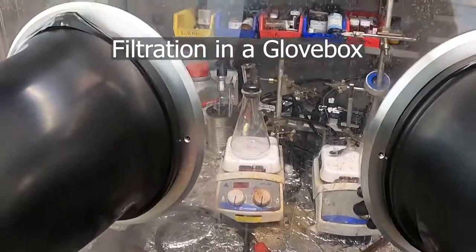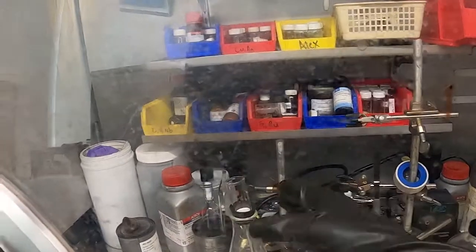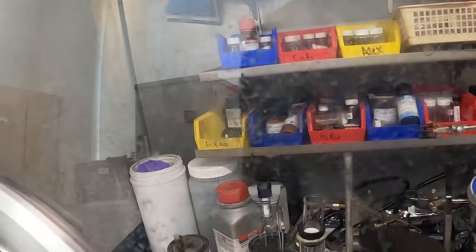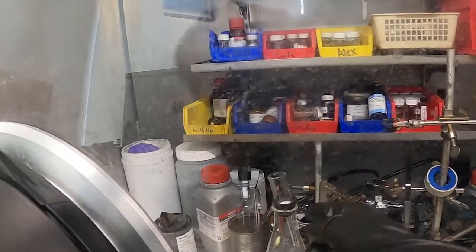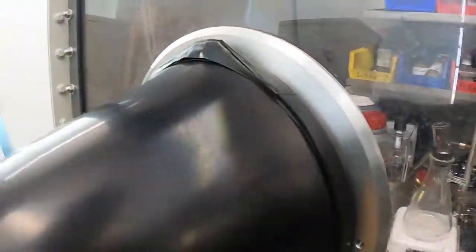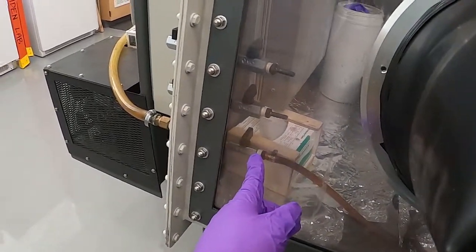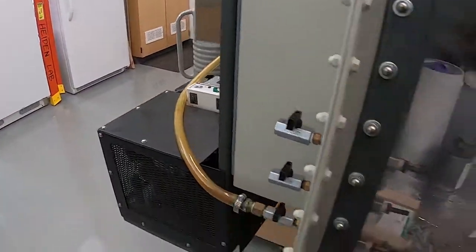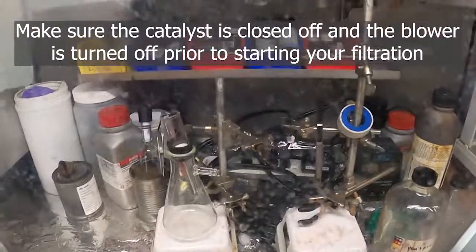One of the ways that you can do an air-free filtration is in the glove box, and just do it like you would normally on the bench. You have a fritted funnel, a gasket, and a filter flask, and you attach the hose to that and pull vacuum. This glove box has an external vacuum, so we have the valve right there to turn it on from the inside, and that's one from the outside.